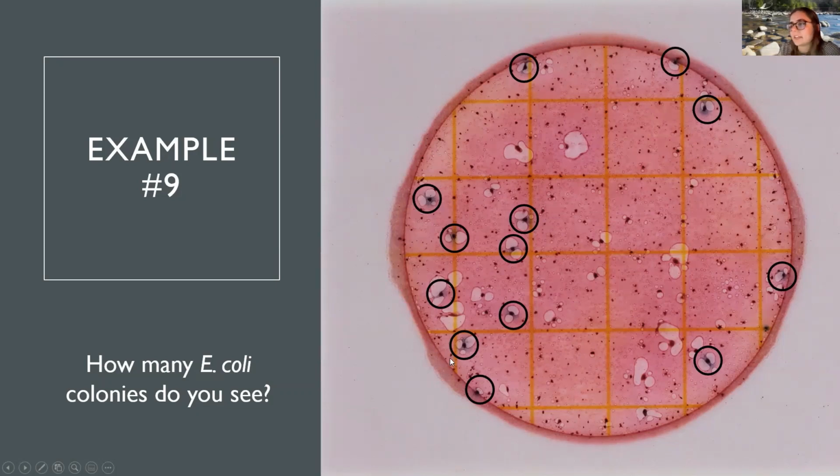So when Jackie was telling us, we're not counting anything halfway outside of that medium. So anything that's more than halfway outside of that line, we're not going to count. But we did count this one because you can see the line here and it's definitely more than halfway inside. So that one is one that we counted.